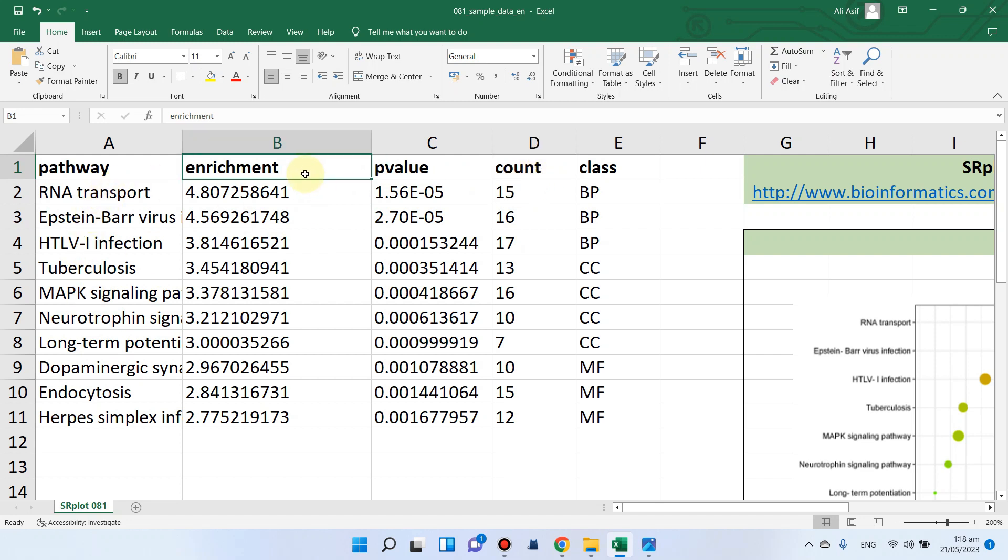Enrichment score is actually the number of genes specific to that pathway divided by total number of genes in all pathways. You will get all this list from your company.